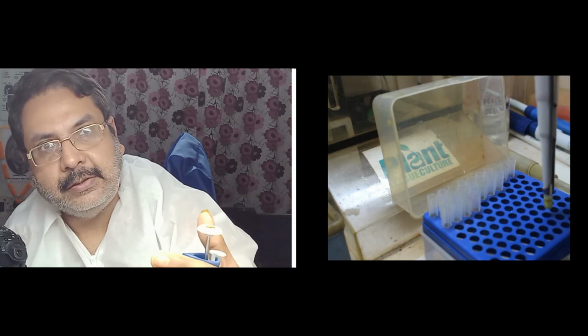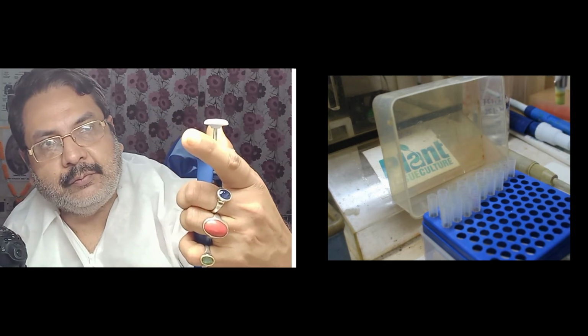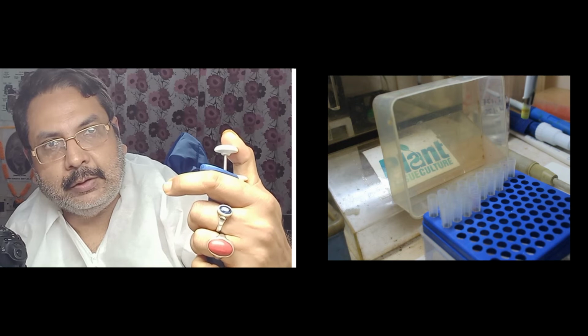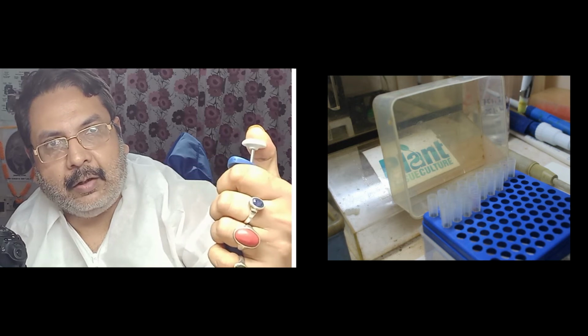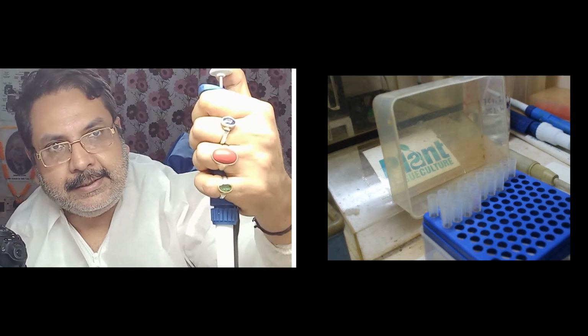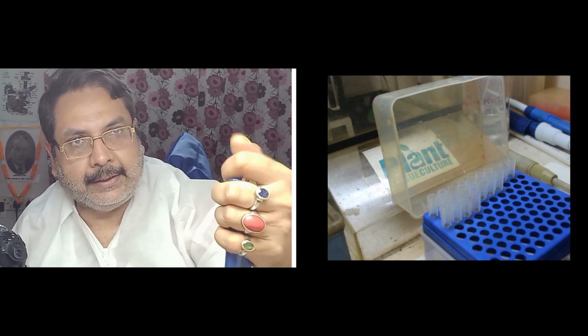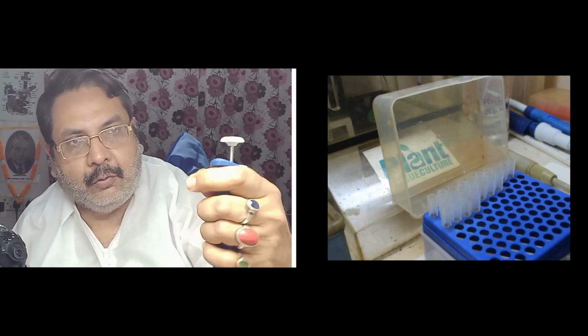Just open the tip box like this, and take the auto pipette like this. You have to hold the auto pipette with the forefinger on the top and the three fingers below, and this is the thumb. The thumb will push the plunger. This is the only way to hold the auto pipette. Don't hold like this, or like this. You always hold like this.